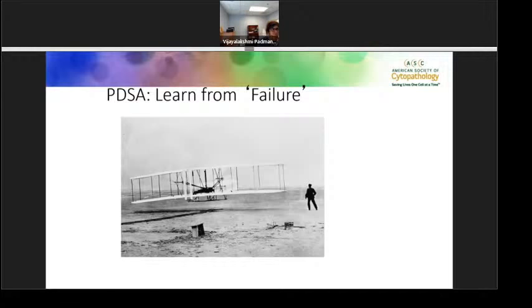Okay, there's a couple of questions. Circling back to your talk, what is your cell block process? So currently where I am, there are different processes that we've used. We pretty much spin down our specimen, and we sometimes use agar if it's a very minute specimen, but if not, we use the whole pellet to make our cell block and fix it in formalin. A lot of our specimens get collected in normal saline, so we just spin it and collect the entire specimen and use it, or use agar. There's even a book that's just come out for making cell blocks. Interesting. Okay.